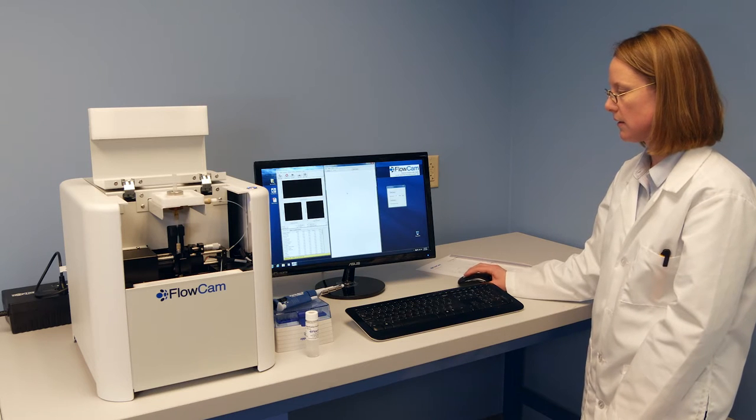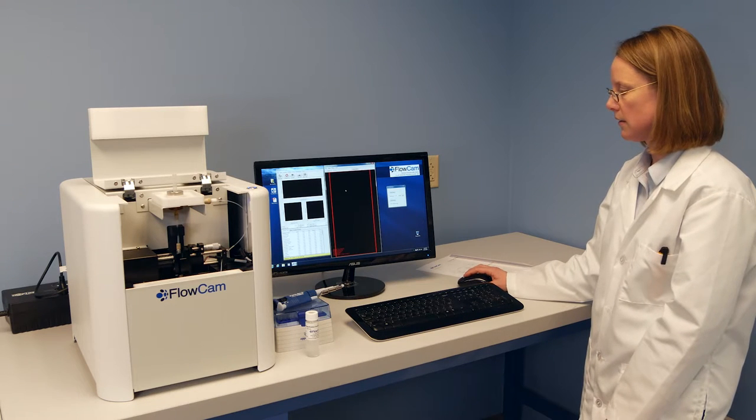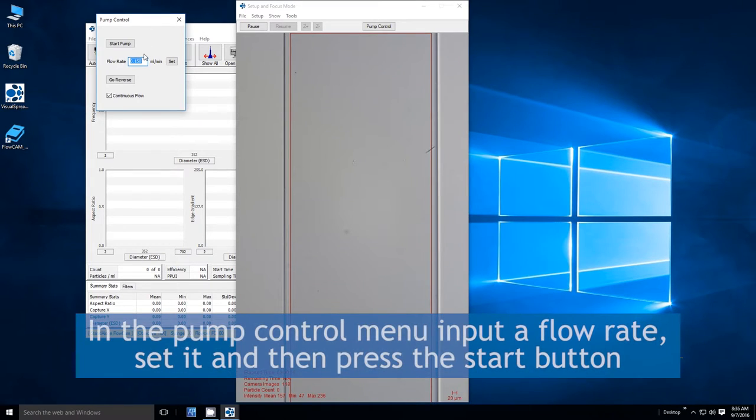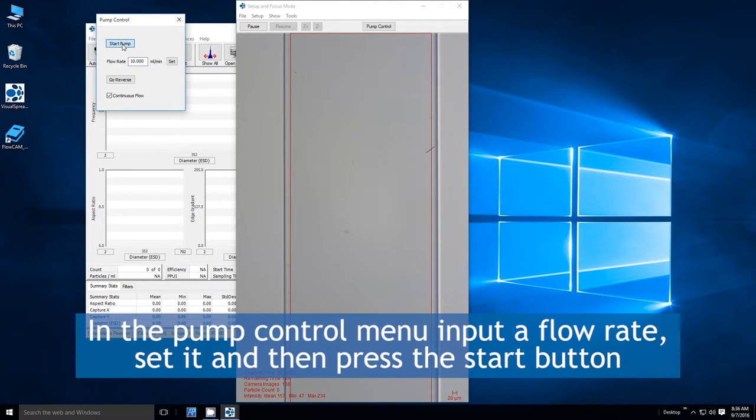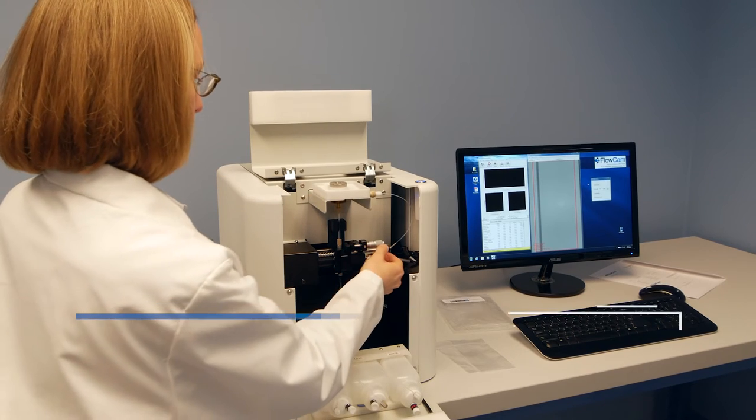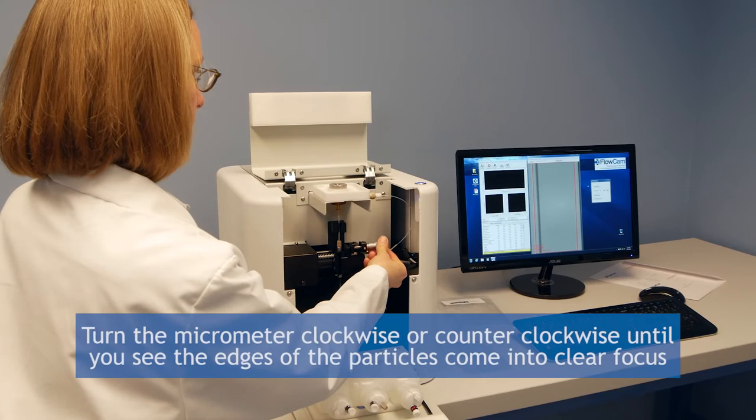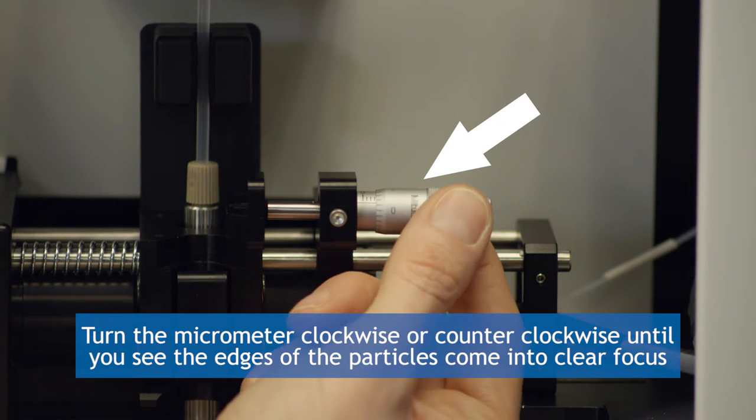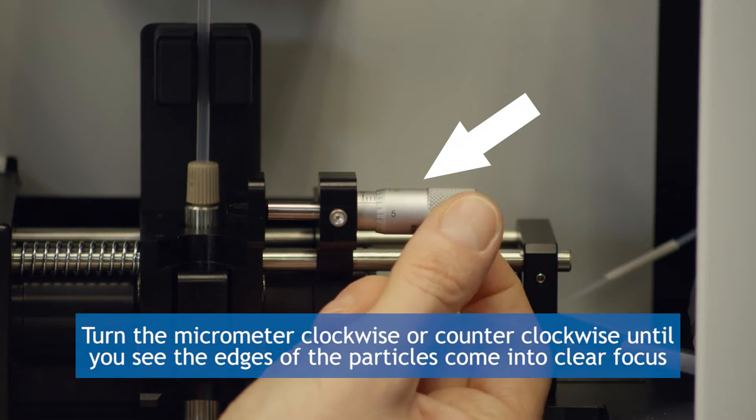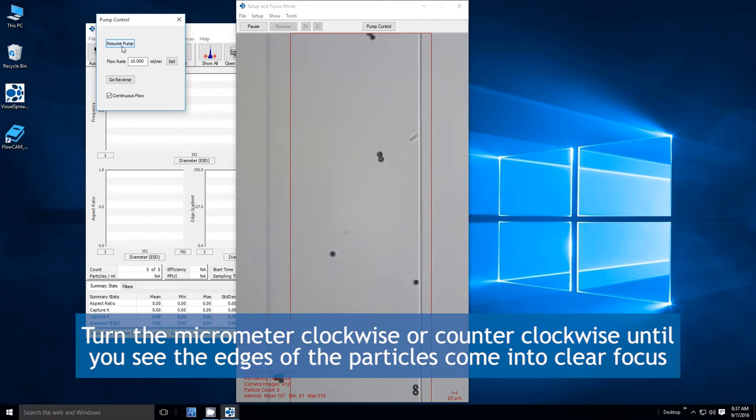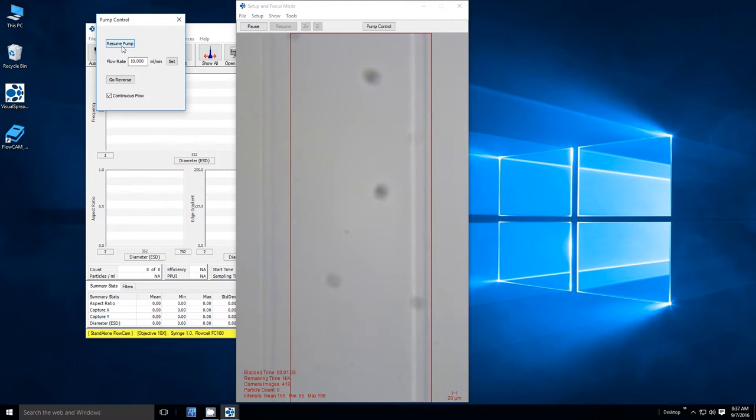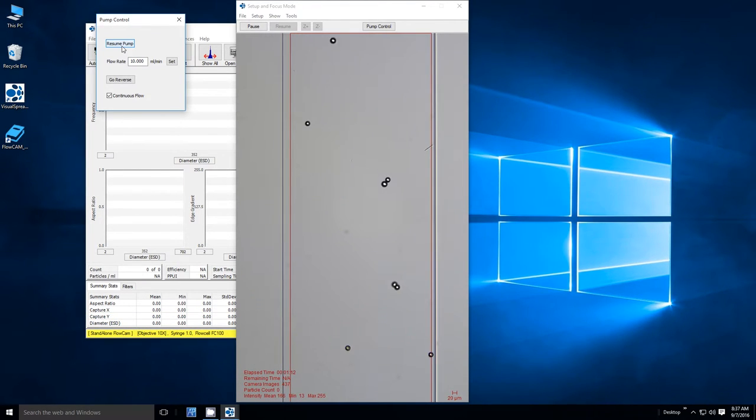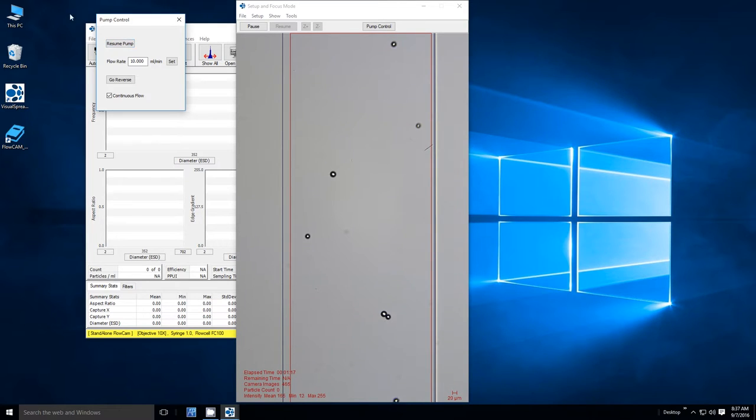Using the pump control menu that opened with the setup and focus screen, input a flow rate, set it, and then draw the sample down into visual view on the camera screen by pressing the start button. Note that the pause button will stop the current flow. For manually focusing the system, turn the micrometer either clockwise or counterclockwise until you see the edges of the particles come into clear focus. You will need a sample concentrated enough in the camera window to ensure you are focusing the majority of the particles to an optimum, consistent level.